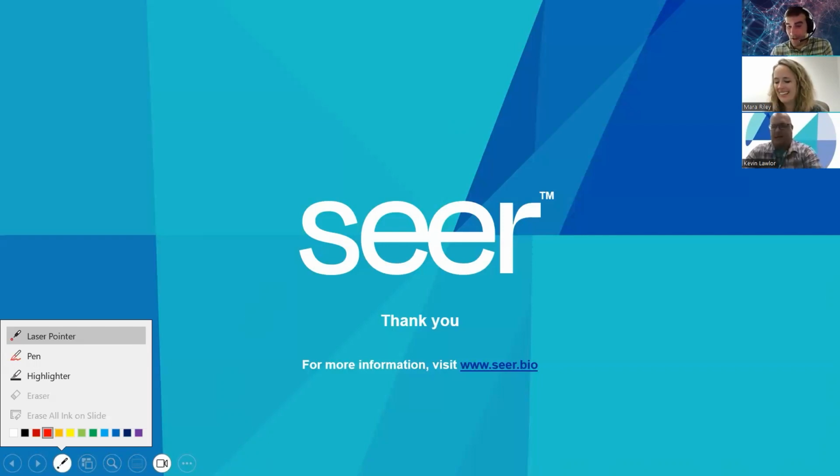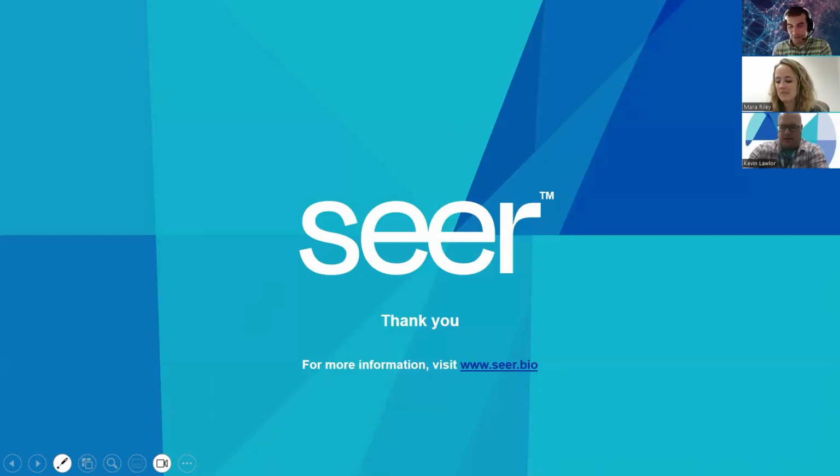Okay. Then another question about the analysis side of things, because that's where I really live. I've noticed things sometimes get a little bit funky beyond what is built into a pre-scripted workflow. What kind of customization is available for PASS, in terms of passing it off to open source tools, or even building in custom R or Python functions? Is there any kind of that customization available?